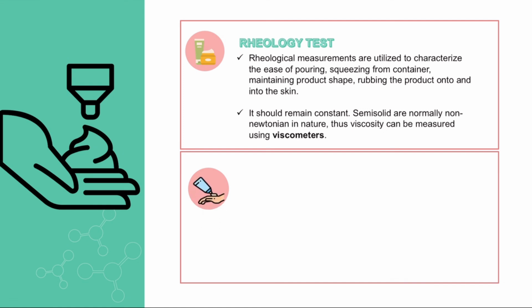Rheological measurements are utilized to characterize the ease of pouring from a bottle, squeezing from a tube or other container, maintaining product shape in a jar or after extrusion, rubbing the product onto and into the skin, and pumping the product from mixing and storage to filling equipment.